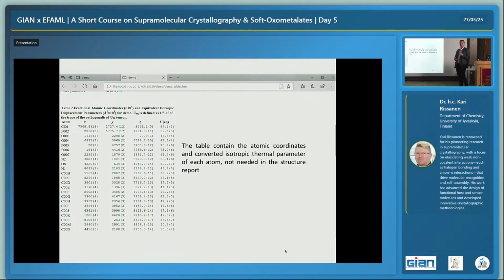That's the most important table because it contains all the information. If you have a chiral molecule in a non-centrosymmetric space group, you will get the Flack parameter. But if it's not, then it doesn't appear, because you can't calculate the Flack parameter in a case where there is a mirror image. It's not calculated, so you don't have to worry about it. But then what it prints out, of course, and previously, let's say 25 years ago, this was also printed in the publication. The real publication, not even an SI. At that time, there was no SI, so everything was printed in the manuscript.